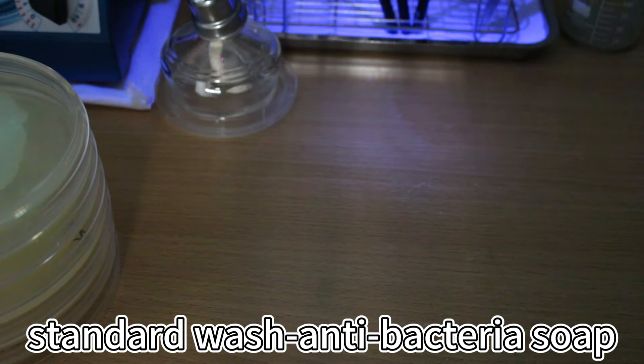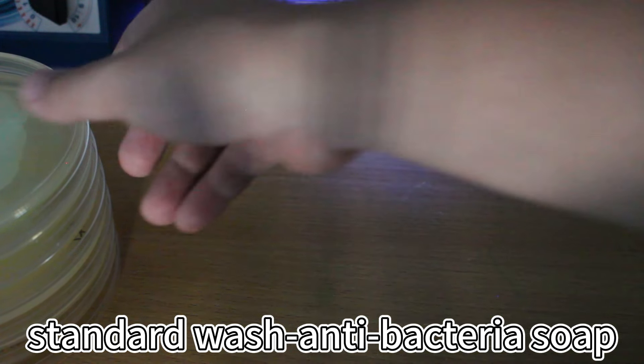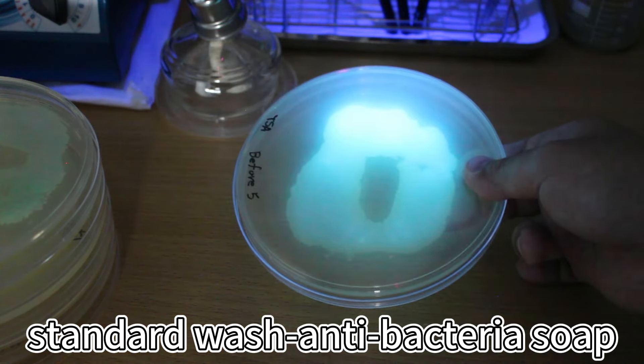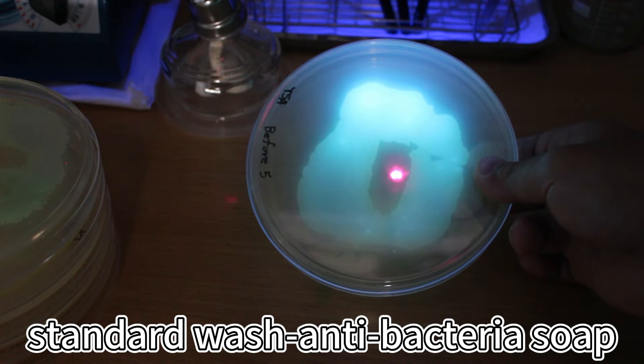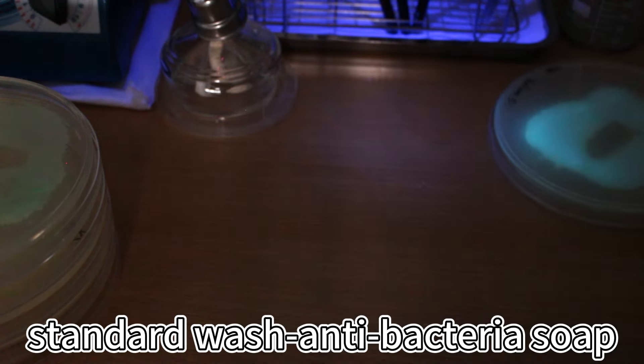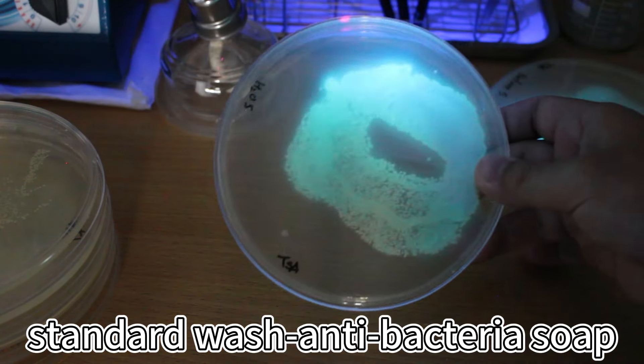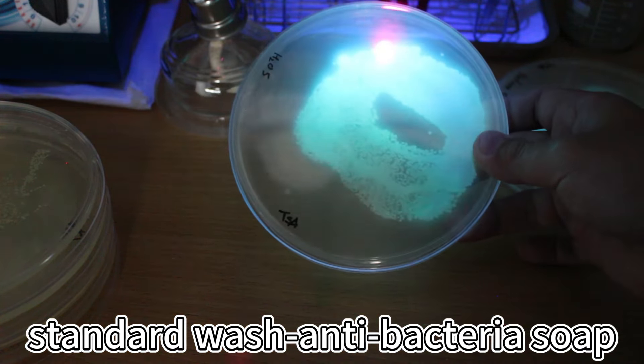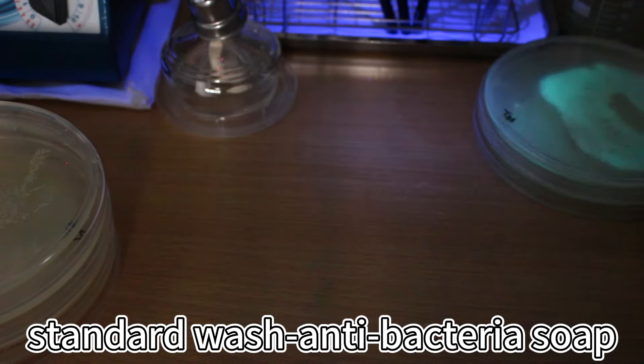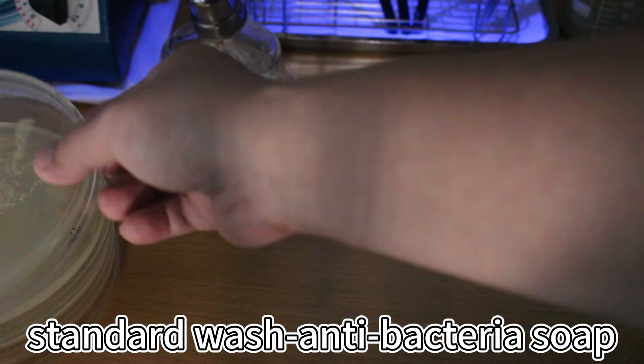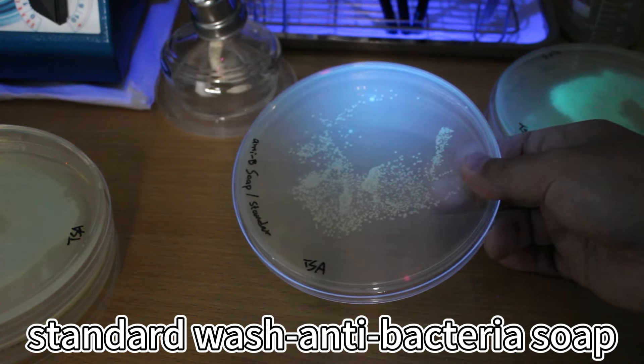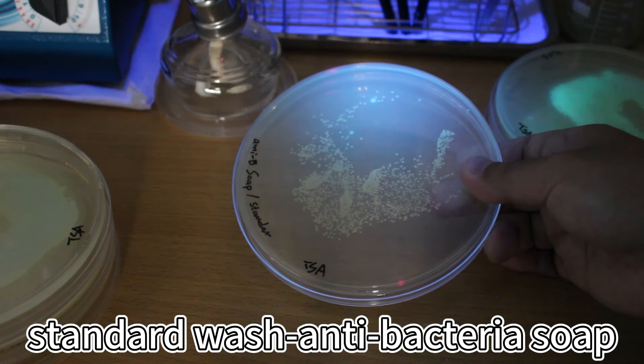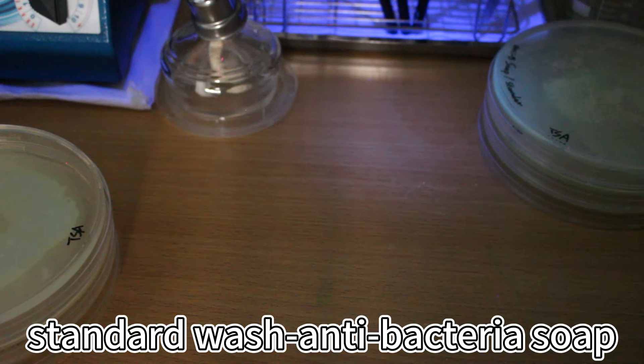Now let's see the standard wash group. This is before wash. After water rinsing. So this is the normal soap group and this is the standard wash with antibacterial soap. You can see there is almost no glowing colony.